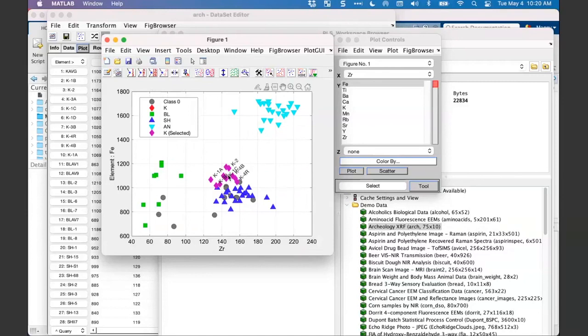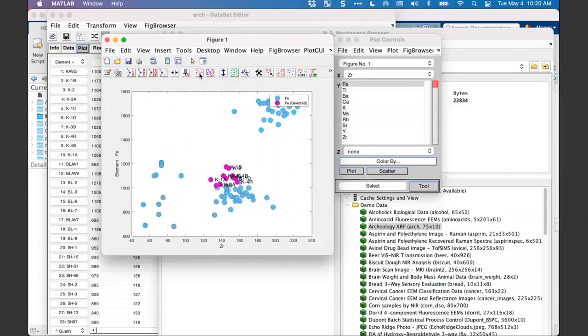One thing that I'm going to do, and you have to keep that in mind when you have a lot of data: if you keep your labels on, and then you do something like, for example, I'm going to go now and toggle to showing no classes. So I press there. Right now, because I have the selection, it is still keeping only those labels.